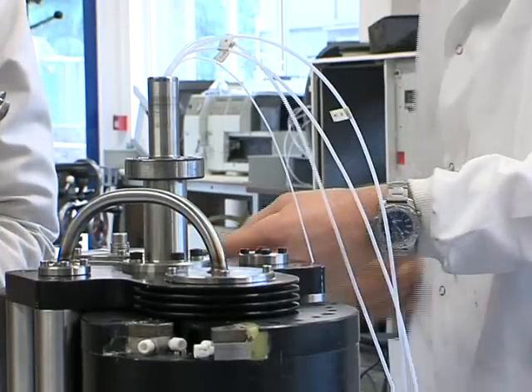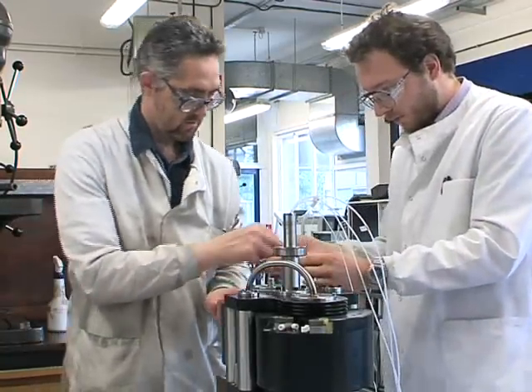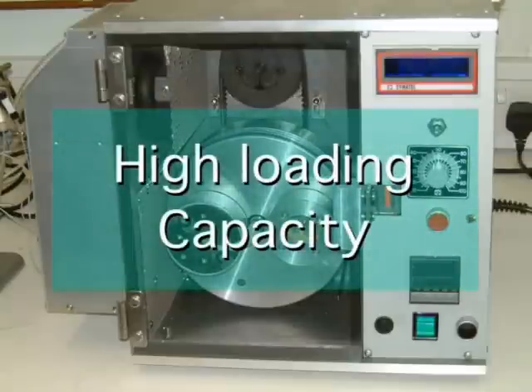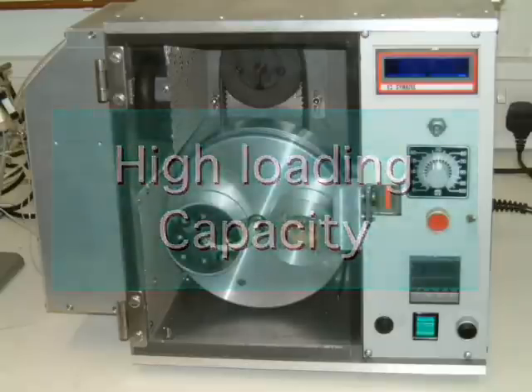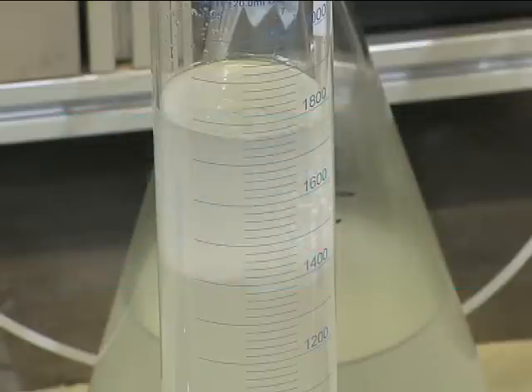Overall, the technique has a number of distinct advantages over traditional solid phase chromatography, such as high loading capacity. Even the smallest countercurrent chromatography centrifuge of 5 milliliters capacity is capable of accepting an injection loading of 50 milligrams of crude material. No need to filter. Cell debris and particulates are tolerated. A one-step purification from a crude extract is possible.